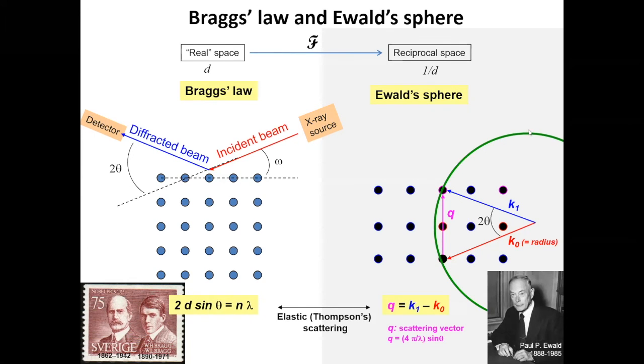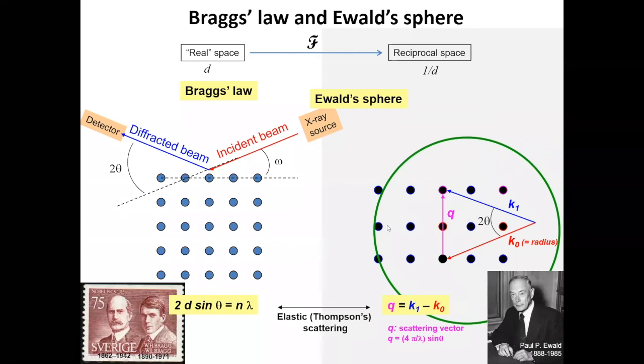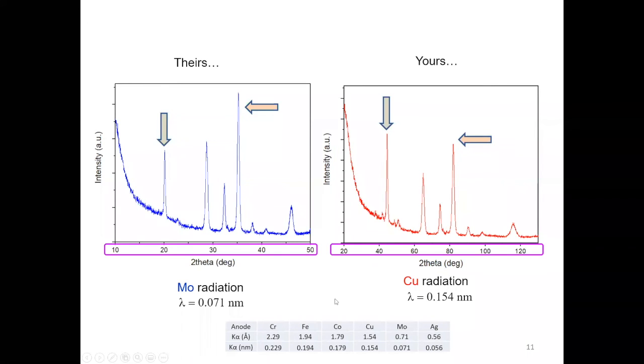Remember that the concept of Bragg's law is very important, because what we're going to use next is to look at the data. When we talk to researchers, we ask what exactly were the conditions of the measurement in the literature, and compared to what? Most likely the people in the literature will sometimes have a different wavelength, a different type of radiation than the one the researcher is using, so of course the peaks will show up at different locations. From Bragg's law, you can understand that a different wavelength will give you a peak at a different location for the same d material property.